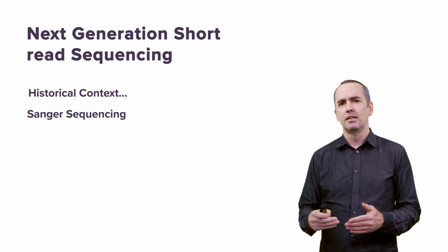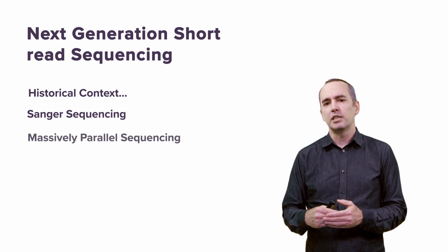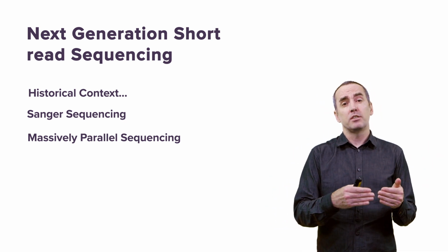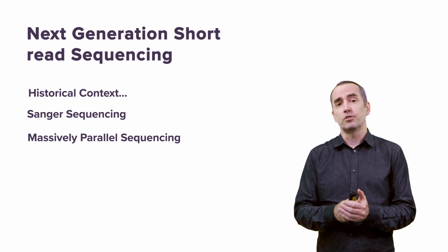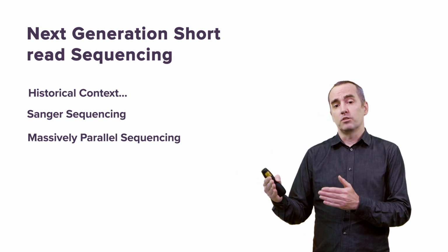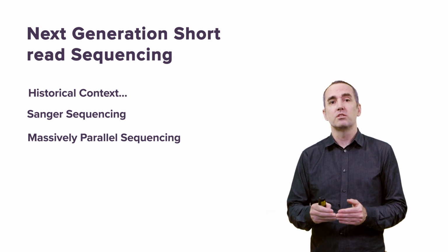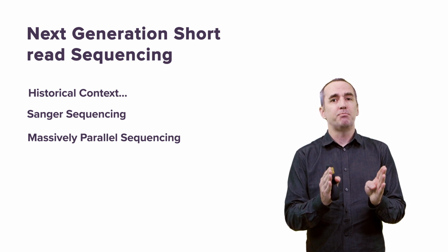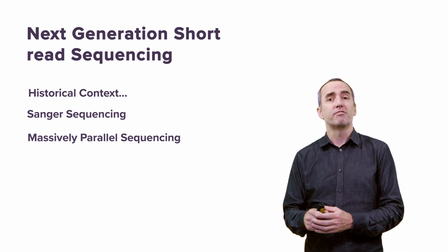In 2006, technologies we referred to at the time as massively parallel sequencing emerged, and these technologies we now refer to as next-generation sequencing, but also a subclass of next-generation sequencing, that is, the second-generation class of sequencers. We distinguish second-generation sequencers from third-generation sequencers, which are long-read sequencers. Okay, so second-generation sequencing is sequencing of short sequences of DNA in a massively parallel context, whereas for long-read sequencers, the target is to sequence much longer fragments of DNA.